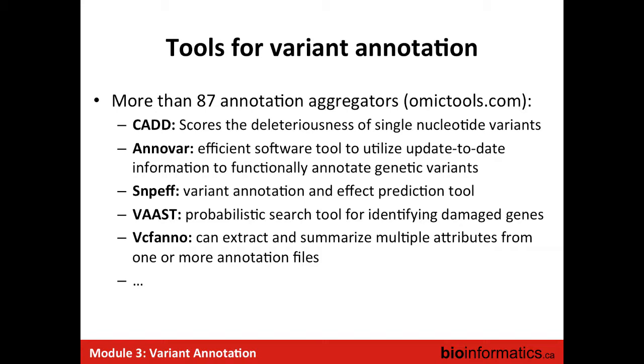And itself, it will go to the various appropriate databases and will actually predict impact using also a collection or an ensemble of effect prediction algorithms. Again, there's quite a number of tools that do this in different ways, and in some cases they claim to prioritize the variants even better. I wouldn't say that there's just one way of doing this. At some level it's convenience, but being able to run one tool that's going to aggregate annotation and effect prediction from a number of tools will be good. So we'll try one of them that actually aggregates, as you'll see, a few different types of annotation.